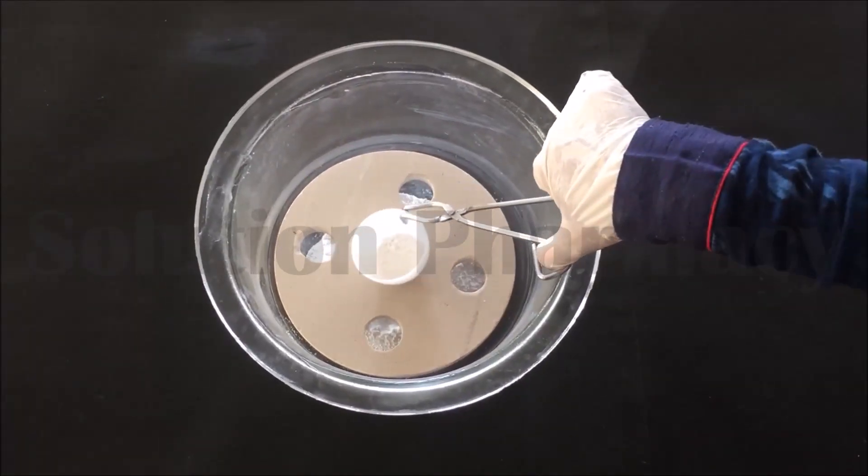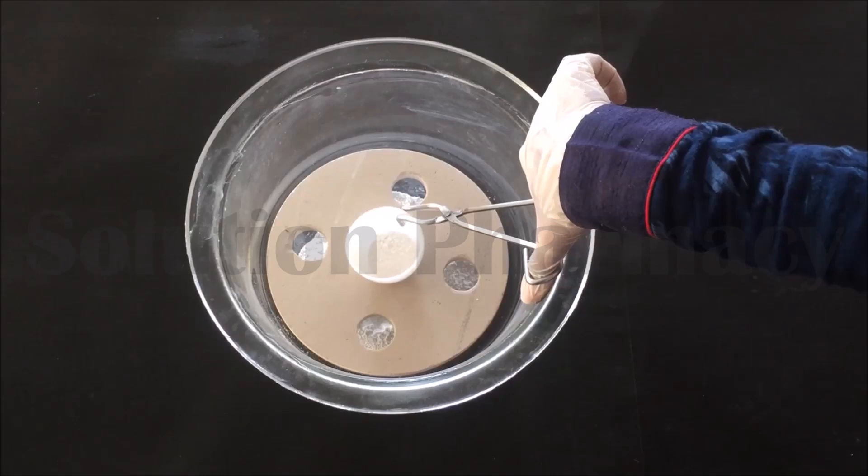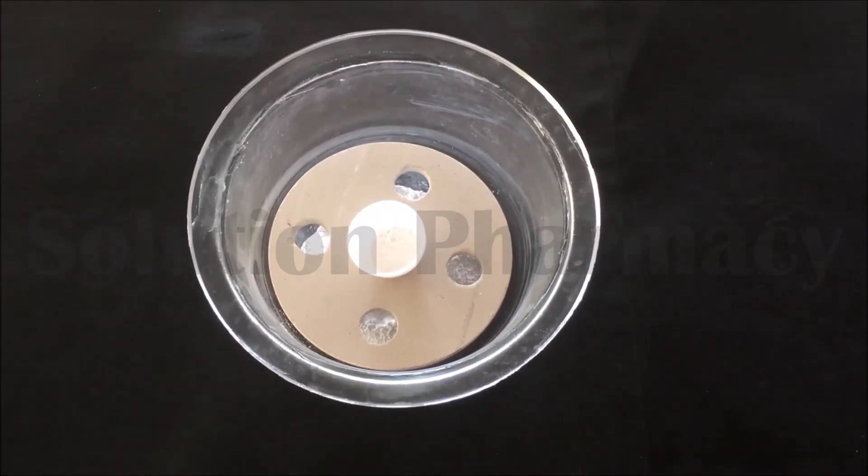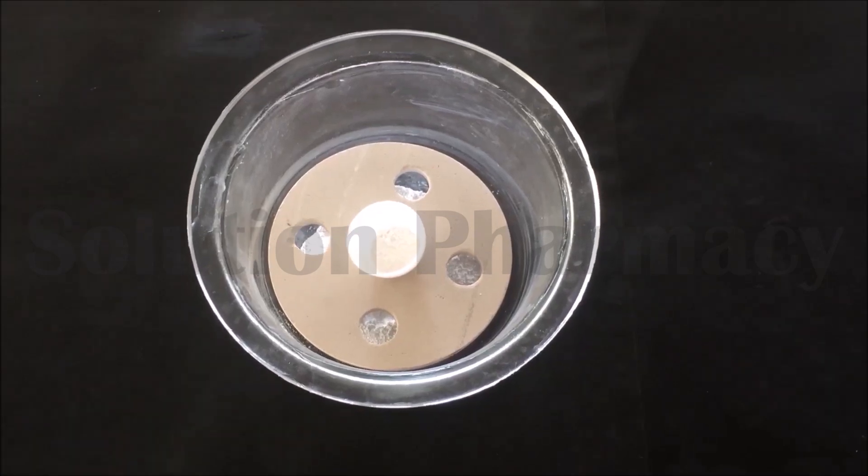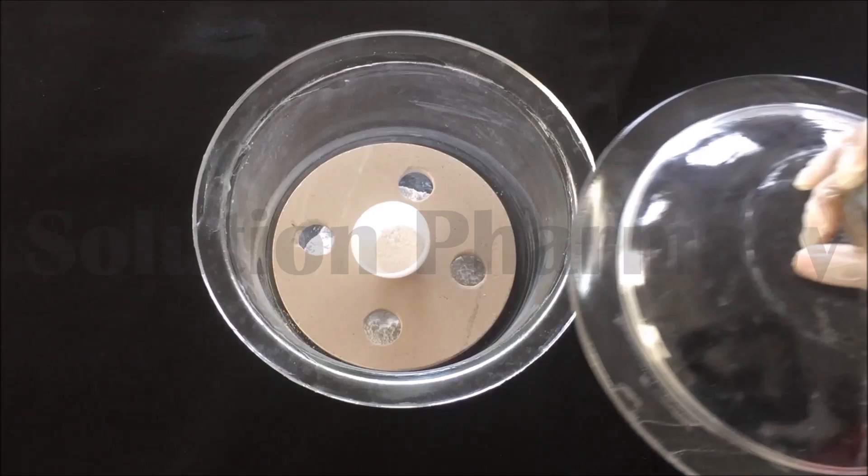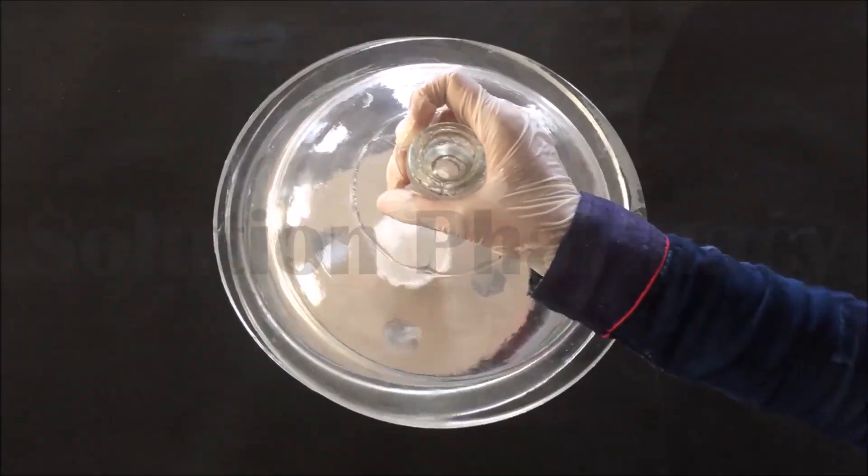Now insert hot crucible containing powder dry drug and put it over the perforated disc of desiccator with the help of tongs. Here we have inserted hot crucible containing dried material into the desiccator to cool it so that it will not reabsorb moisture during cooling. Now cover the desiccator with the lid. Slide the lid in this way over the desiccator to close it.